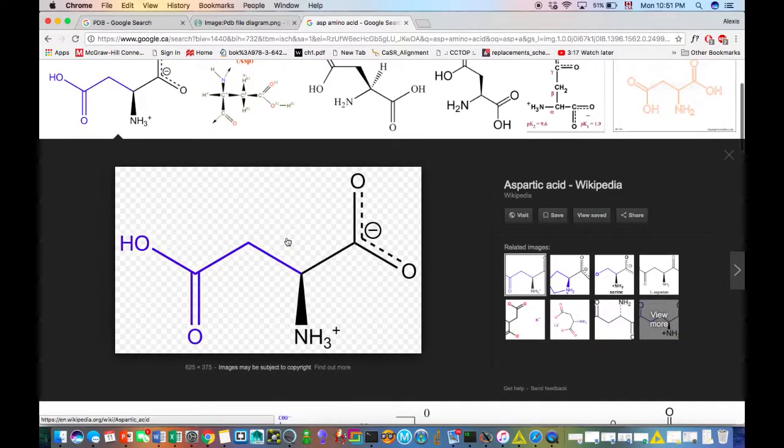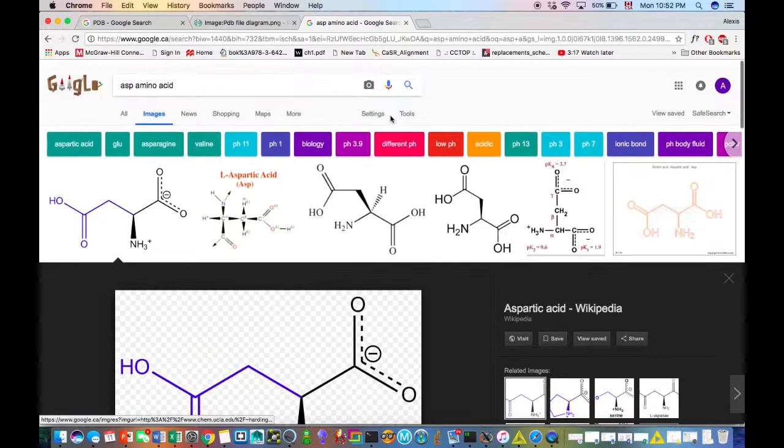It's going to build that framework of an aspartate, and it's going to tell the imager that this is related to this particular amino acid. So the software is going to identify this as, let's say, aspartate number 21.